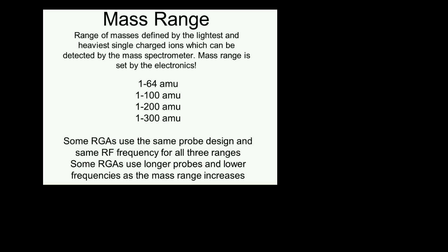And then we get to the 300 AMU unit. The people that buy 300 AMU, and there's not a lot of them, do it because they're truly doing gas analysis for analytical purposes.